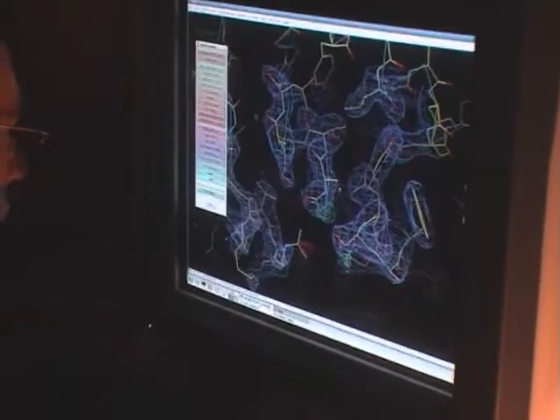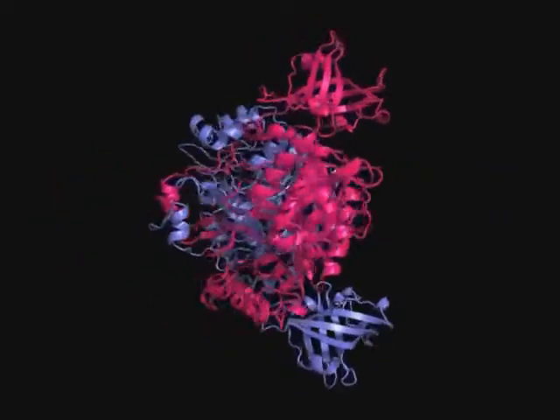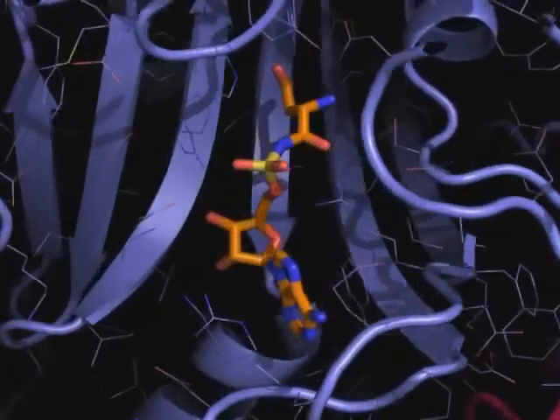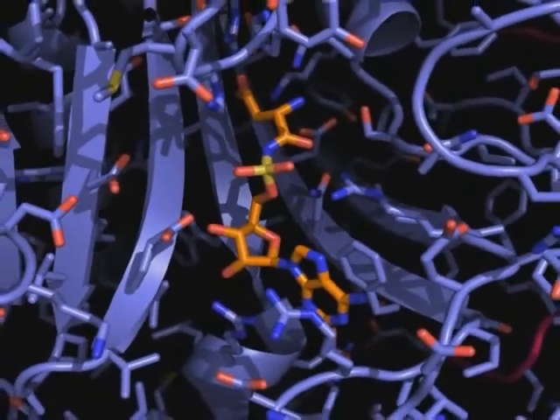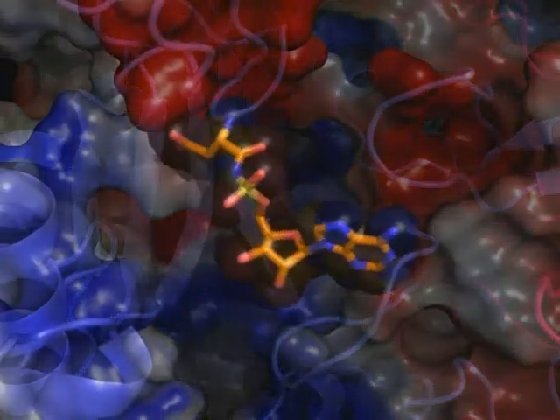For instance, they can reveal to us how an enzyme recognizes a smaller molecule to bring about a chemical reaction, or how an antibiotic molecule interacts with its cellular target. The type of structural study described in this film is used in fundamental science to understand the functioning of the biological macromolecules, but this kind of study is also used in more applied areas to develop active molecules which will lead to the drugs of tomorrow.